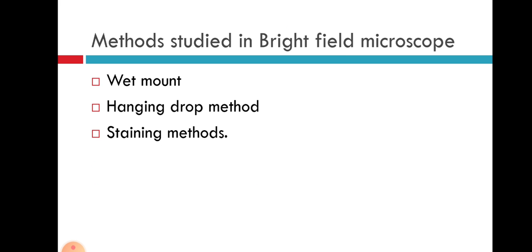Bright field microscope is used to study wet mounts, hanging drop methods, and staining methods.